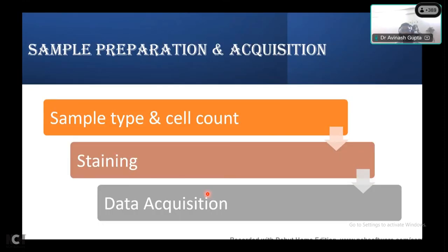So sample preparation: once you receive the sample and you decide your panel, what do you have to consider in your mind? What is the sample type, what is the cell count, what staining method are you going to choose, and points about the data acquisition, because you are going to prepare the sample and then acquire it on your flow cytometer.